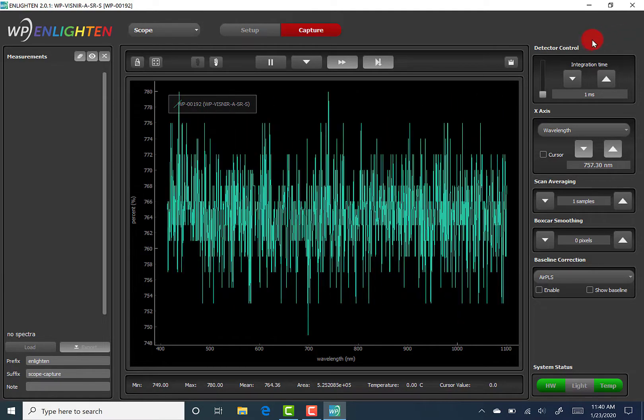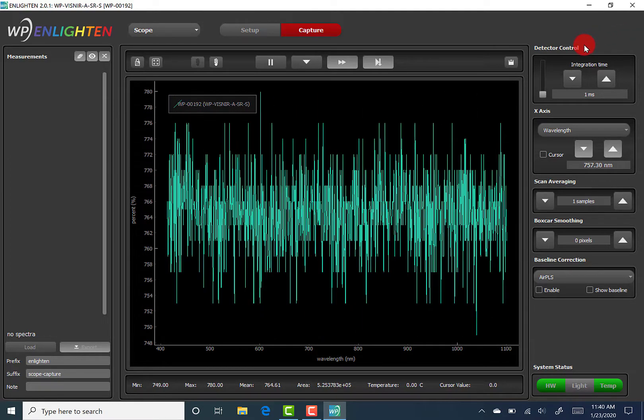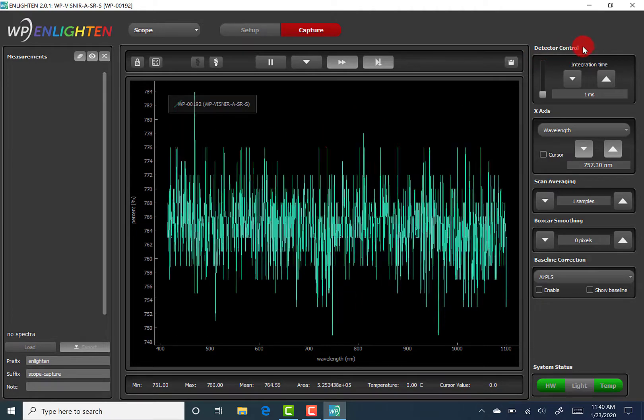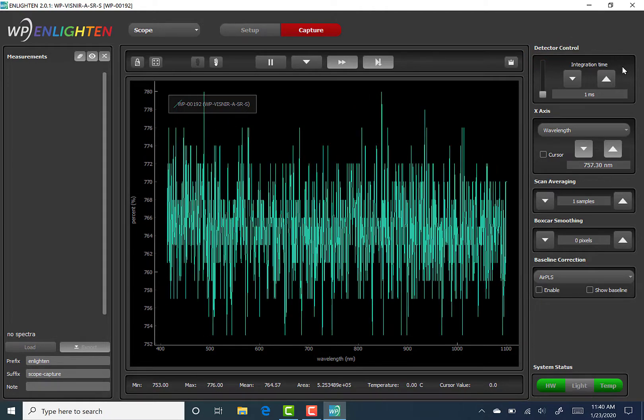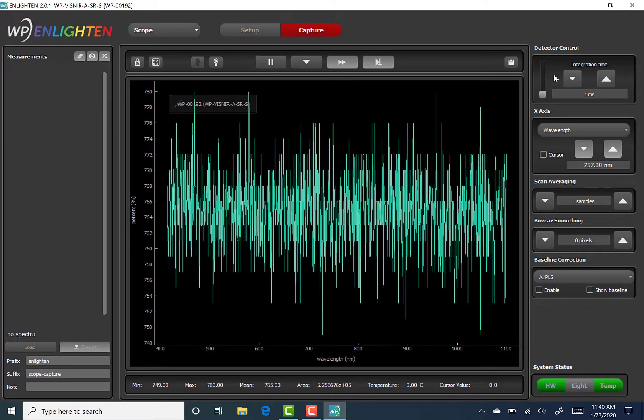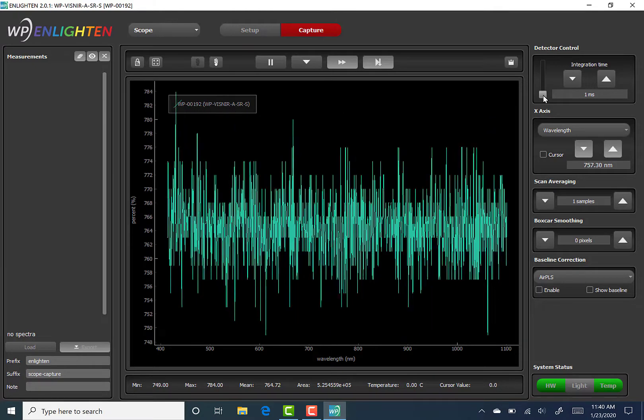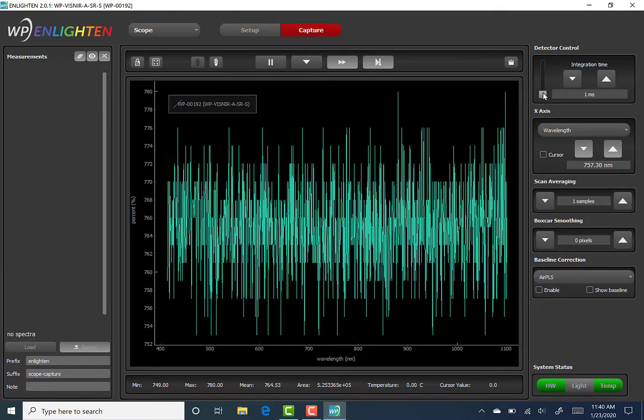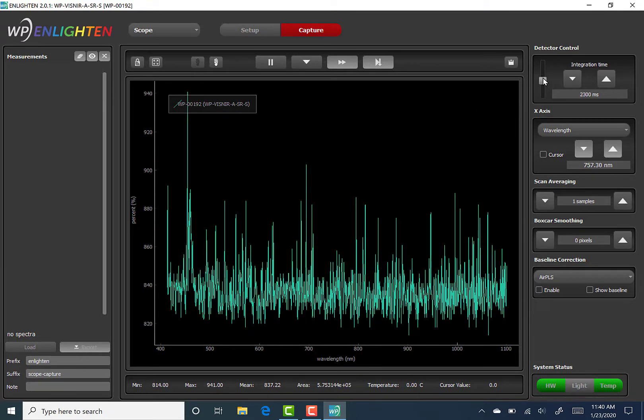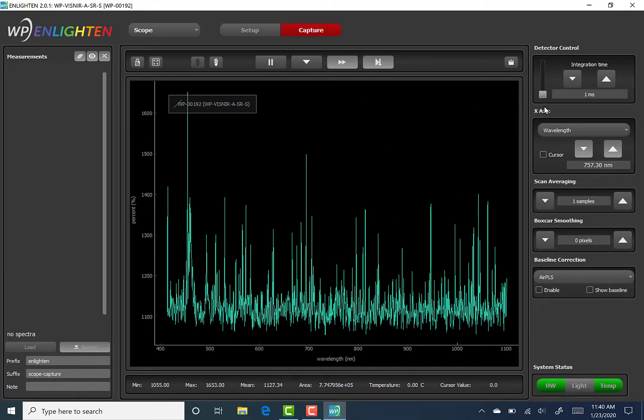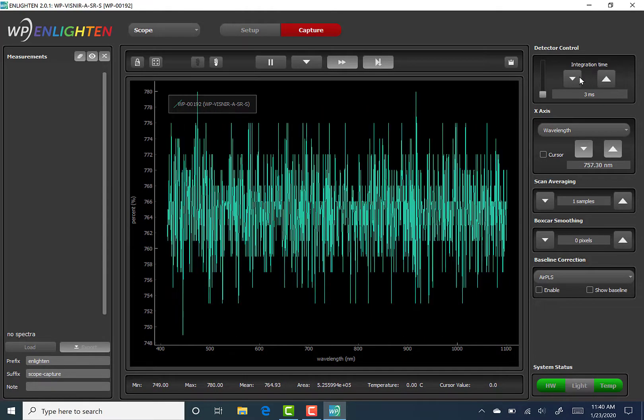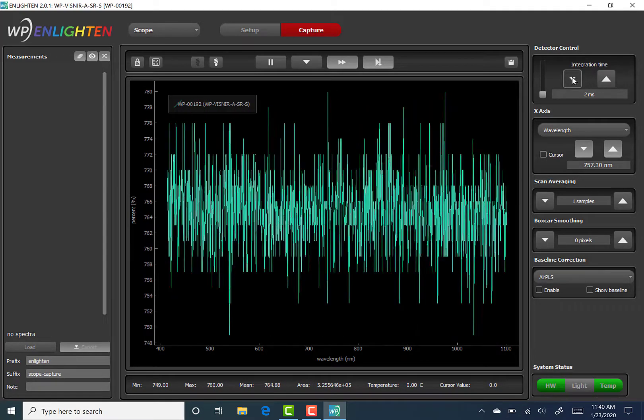The detector control function, which is visible on my screen, allows the user to set integration times in milliseconds using either the vertical slider, where moving upwards increases the integration time, using the up and down arrows, or simply clicking in the editable numeric field below the arrows.